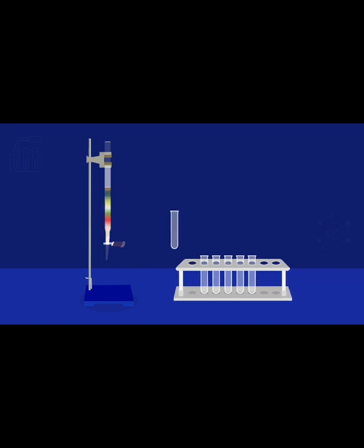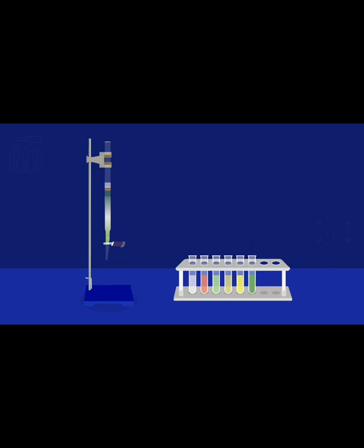You can see fine bands developing as the compounds move through the stationary phase. Distinct bands can be visible, which can be eluted and collected in different test tubes or any sample collector. You can see distinct fractions separated based upon polarity. The separation depends upon the solubility of the sample and the affinity of the compounds.